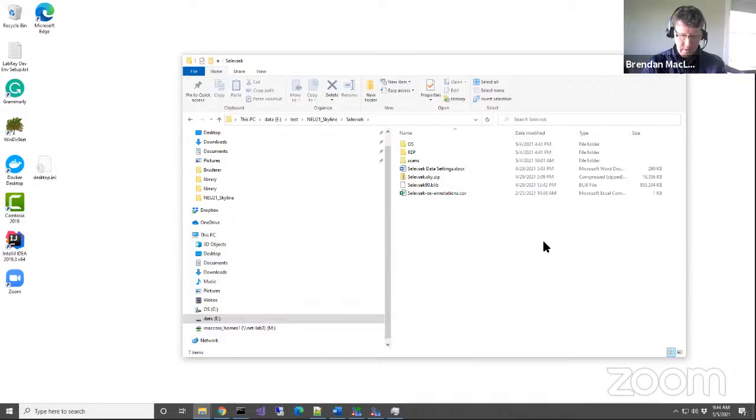Brendan, can I ask you a question? Yeah, sure. It's a little bit of a follow-up on the recalibration, because I think I remember once emailing with Matt about the possibility of recalibrating files with MS Convert with one of the filters, but it will require a peptide identification file like a MZID and the MS file. Can you confirm if this is possible?